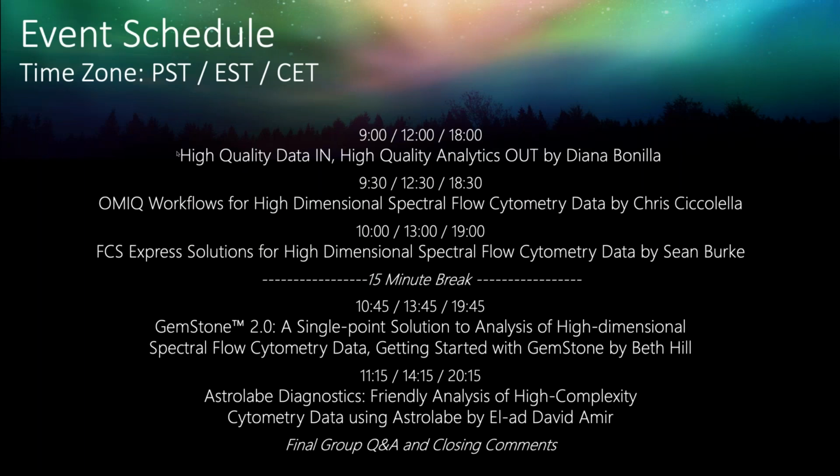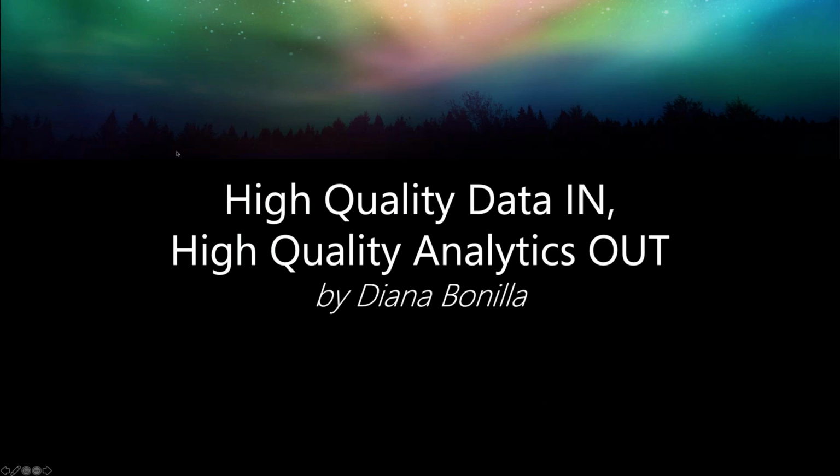I'd like to introduce our first speaker for today. Her name is Diana. She has a Ph.D. in immunology from Texas A&M University and a postdoc degree from Baylor College of Medicine. She is a cytometry specialist and has 20 years of experience in cellular evaluations for a variety of applications, including infectious disease and cancer.